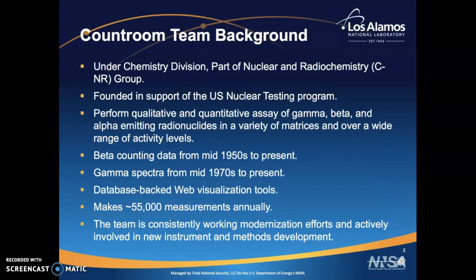To start off, some background about the count room. We are under the chemistry division and part of the nuclear and radiochemistry group. We were founded under the support of the U.S. Nuclear Testing Program. Today, we support numerous programs such as bioassay, treaty monitoring, and nuclear forensics.